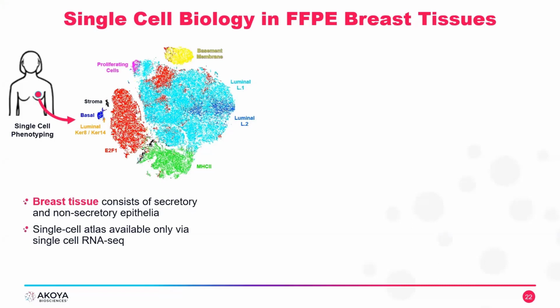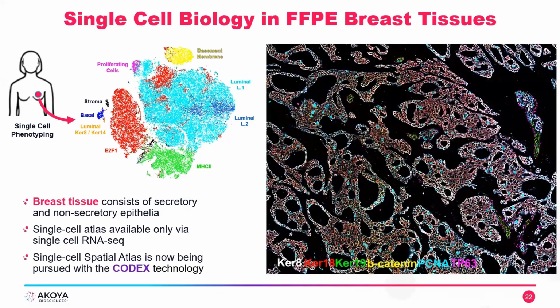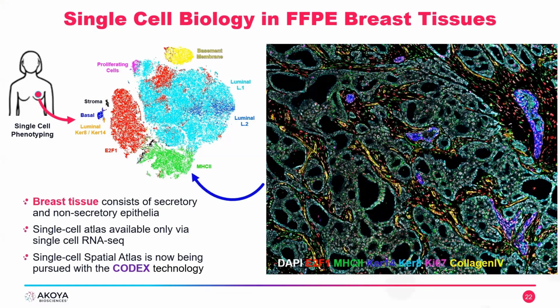And indeed, here in this example, we found something, and you see on the top part, this is a T-SNE plot. A T-SNE plot is like a little cluster where you can visualize a little bit how the expression is going on. And what the scientists together with our team found out is that there are indeed some interesting outcomes here, and those outcomes were only possible to find by using such a high marker panel.